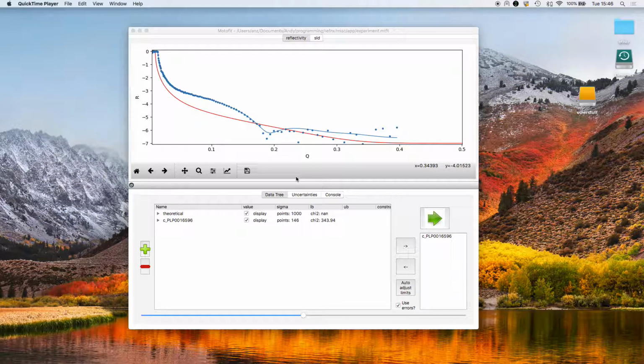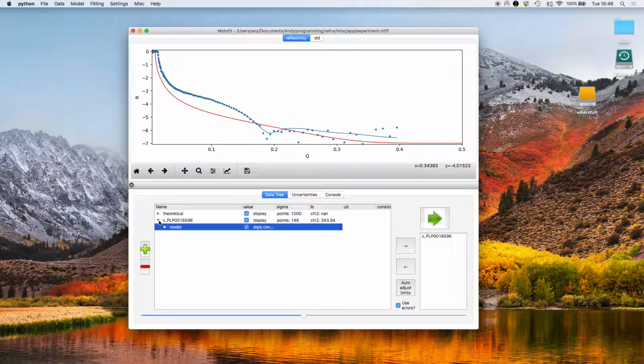This tutorial shows how to fit patchy bilayers, or patchy areas of a system, where over the entire surface of your interface you may have one area covered with one structure and another area covered with another structure. So if you have one area covered with, say, a lipid bilayer and one that wasn't coated, how would we analyse that data set? I'm going to show you from this currently existing structure.